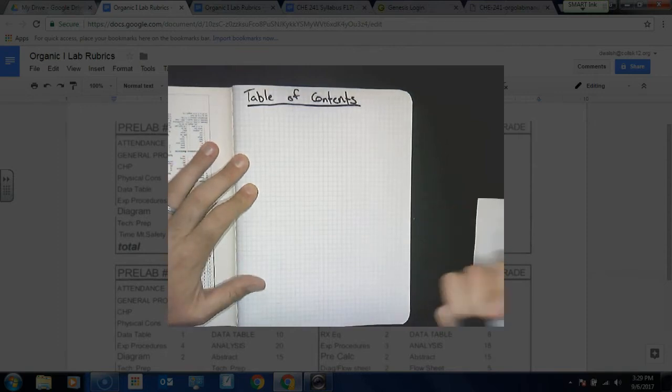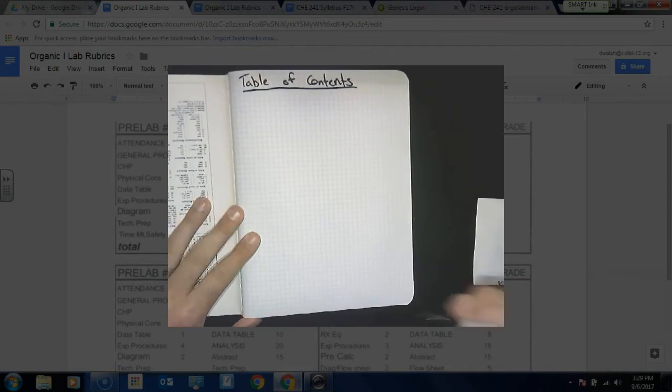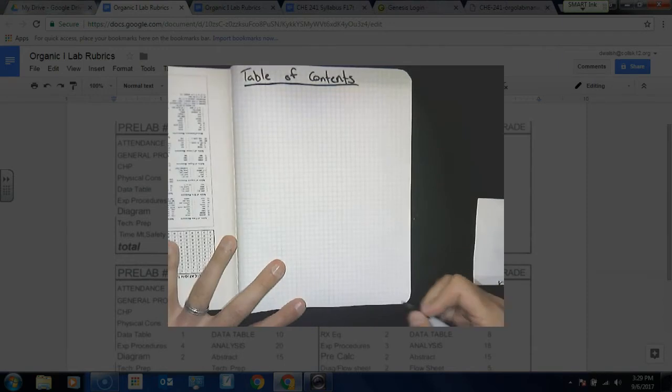The other thing you want to do is number your pages as you're setting this up. You don't have to number every page, but when you do, you're going to start with 101. I say this because this is Volume 1. That's where the first one comes from.